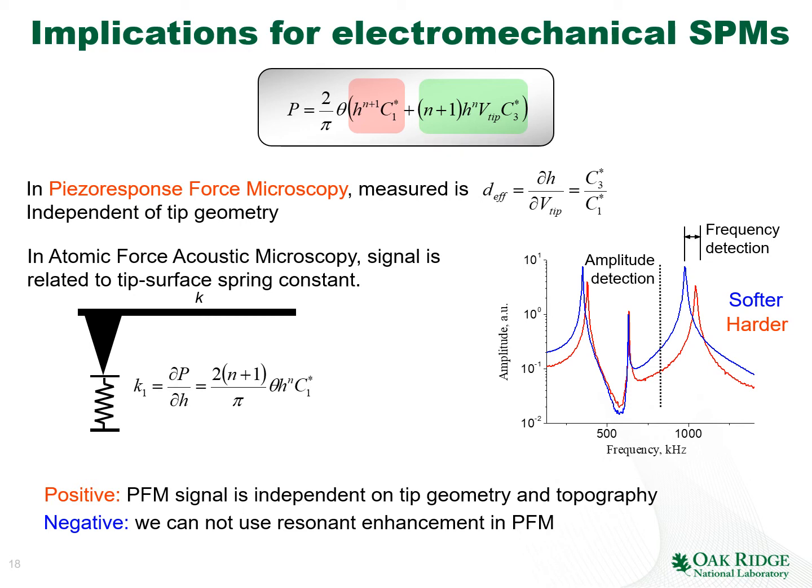That's great. The negative thing is that we cannot use the resonant enhancement in PFM directly. And the reason for that is that if the resonant frequency of the cantilever shifts, the signal as measured by the cantilever also shifts.